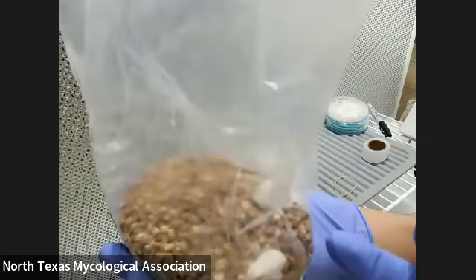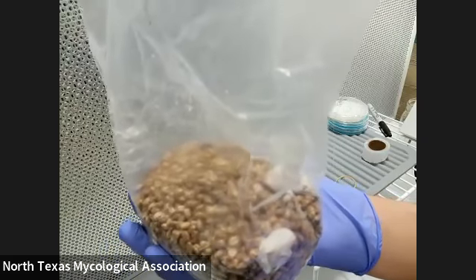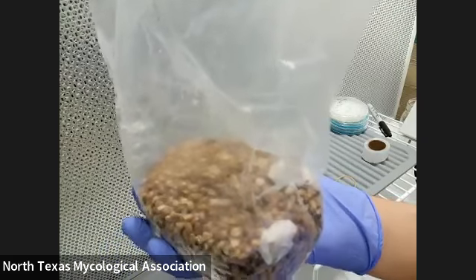Once you take over like one single piece of grain, that becomes an inoculation point for the whole bag. You can see there's probably like a thousand inoculation points here. That's really good. That's why we use grains — it's smaller and it spreads faster. And also food for the mycelium.